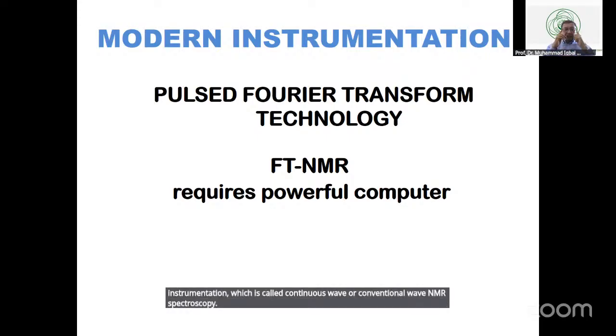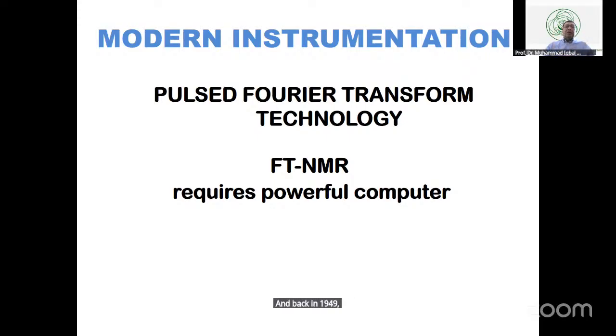And back in 1949, immediately after the development of NMR spectroscopy, someone, his name was Edward Hahn in the US, was puzzled. He said, why do we need to excite one proton by one proton by one proton?